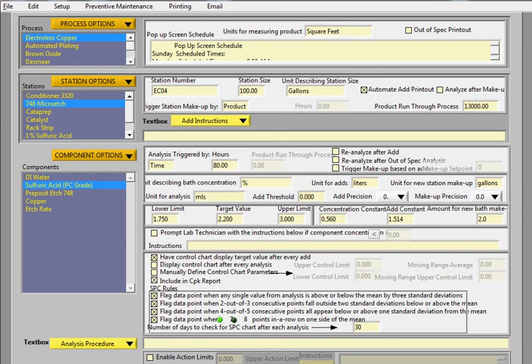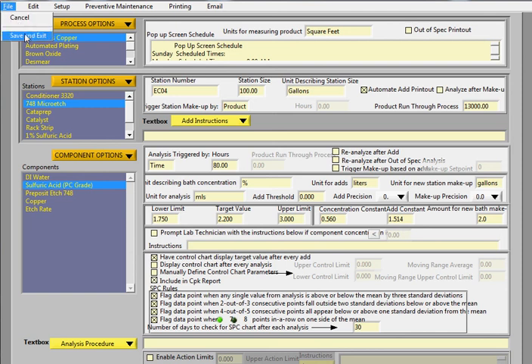We'll finish with a quick walkthrough on what happens when an event is triggered. So we'll go ahead and save and exit here. Or just hit cancel. In this case, cancel.